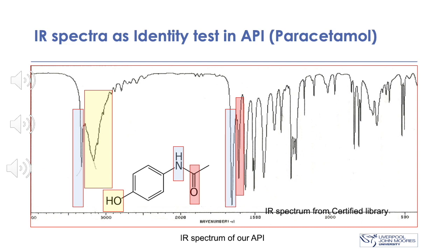One on the very left of the spectra and another one at the very beginning of the region showing the stretching peaks. Remember that in IR we have bending and stretching peaks. Bending a bond is much easier than stretching, so bending the bond needs less energy than stretching the bond. Finally, we can see the signal for the carbonyl, the stretching of the carbonyl bond, in red.